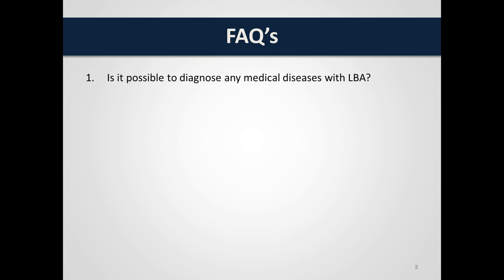Well, no, live blood analysis is not used as a diagnostic tool. Although some indications for specific disease processes can be seen in the blood, it's not meant to be used to diagnose any specific disease. In cases where specific diseases are indicated, one would still need to follow the normal investigations and procedures to diagnose the disease.